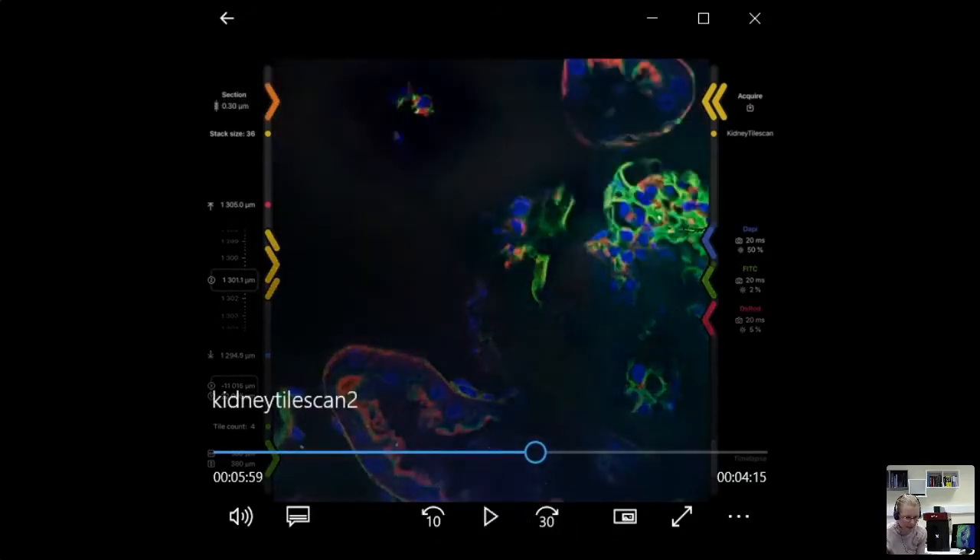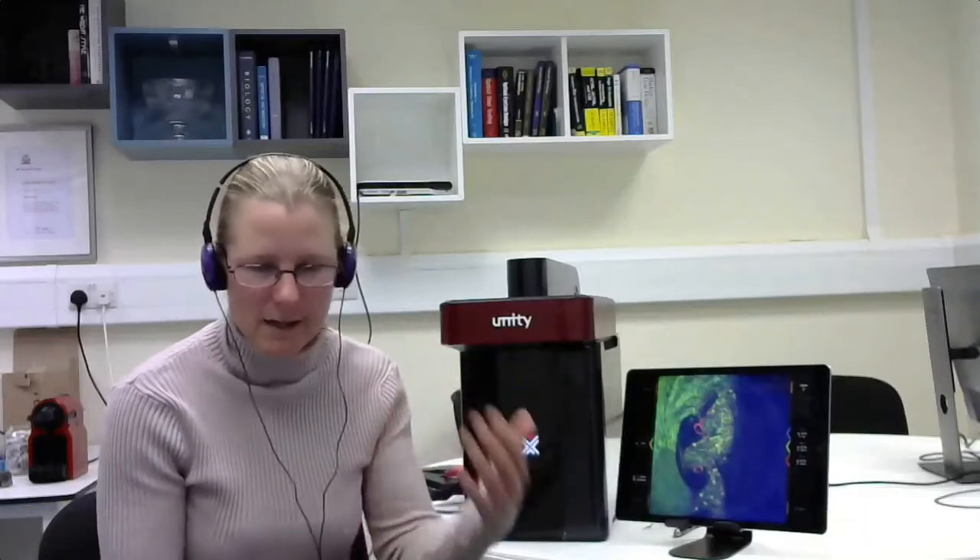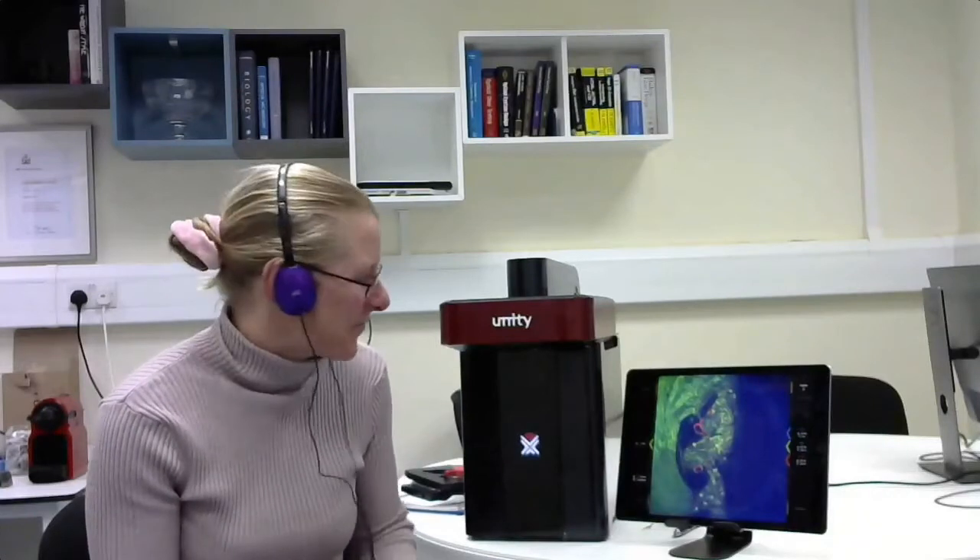I hope that gives you a little bit of a flavor of where we are right now. This is a very new instrument, new on the market, and we're adding new features every day - the graphical user interface is evolving very quickly. Regarding saving and reusing imaging configurations - yes, we can save things, but it's so easy to set up that you probably won't need to. It's so easy to just start again. But of course we can save those configuration files for you, and you can read them back in.